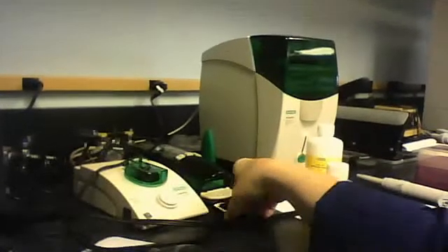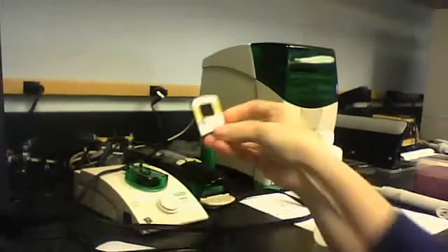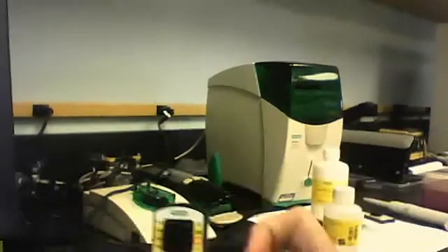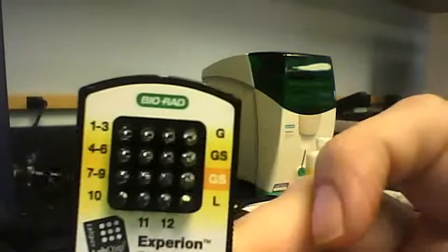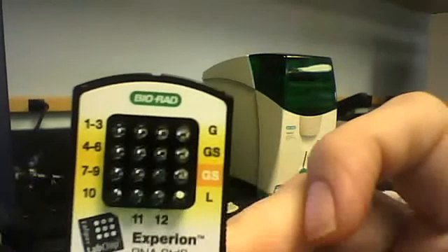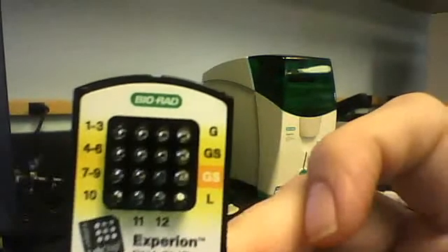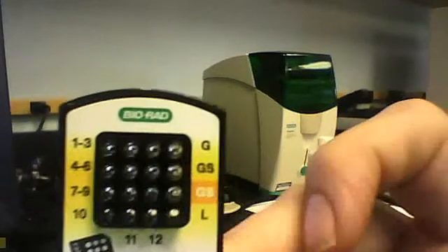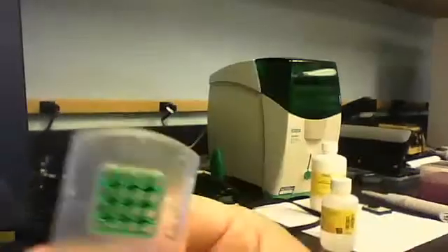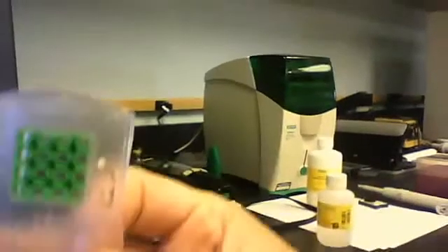This is what the Experion chips look like. I want you to get a real good look at that. These chips are labeled and I'll go over those labels with you soon. And this is your cleaner chip.